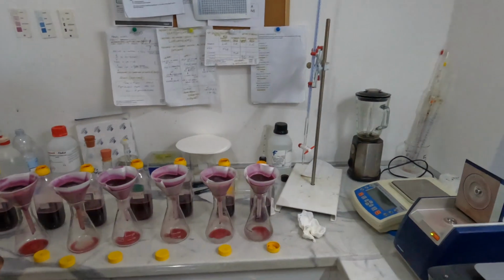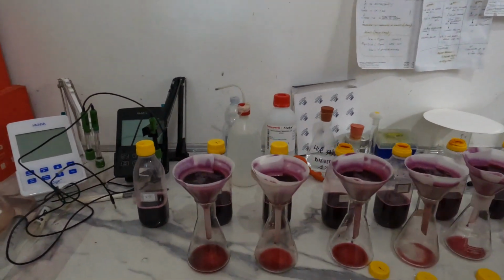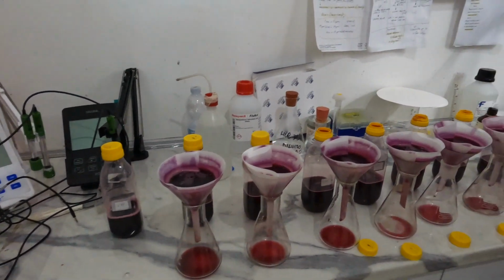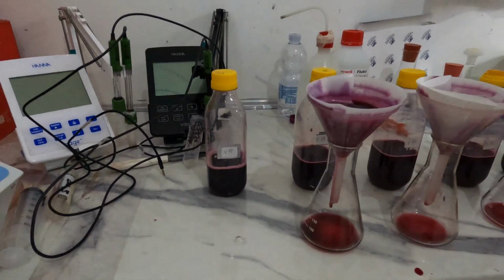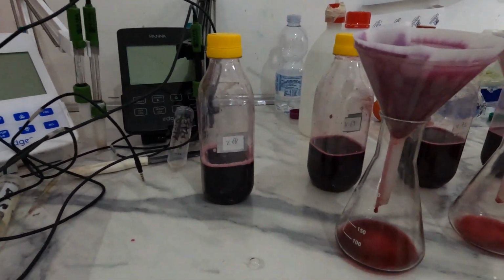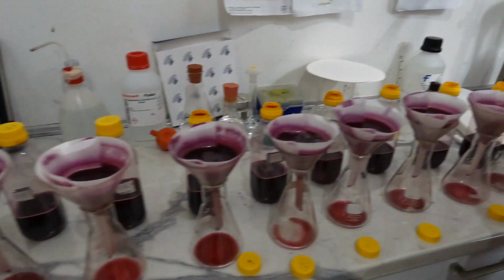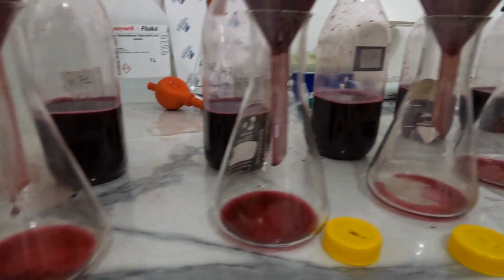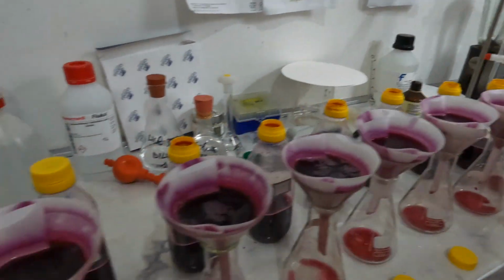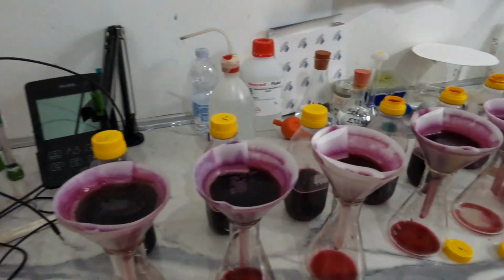So we have different samples from different tanks, obviously, and they're all at different stages of fermentation. And as he said, 68 and 69. This is towards the end here, and 68 is the beginning. So it's interesting how it's getting filtered here through pretty much a basic kind of cloth or paper filter.